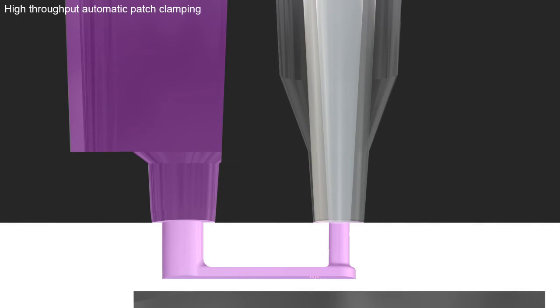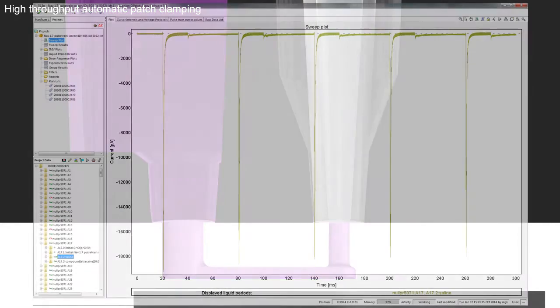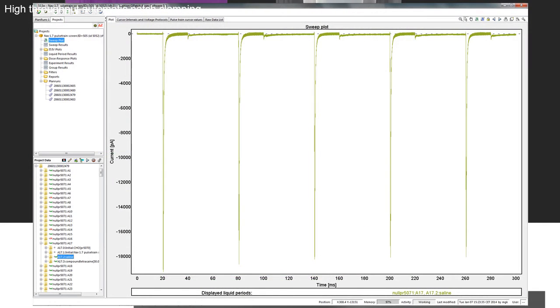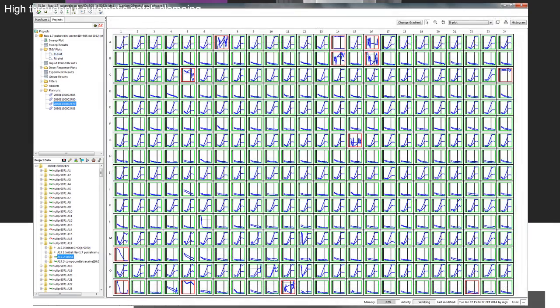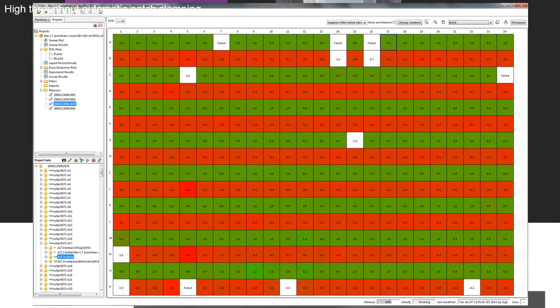Once the experiments are complete, Qube assay software quickly helps you go from raw data to current versus time plots that can be visualized for the entire plate in a glimpse and onwards to hit detection for that plate.